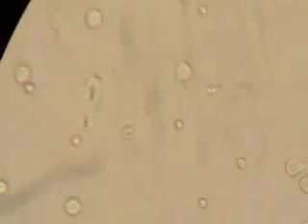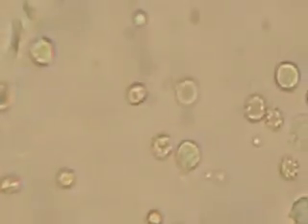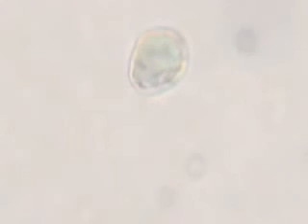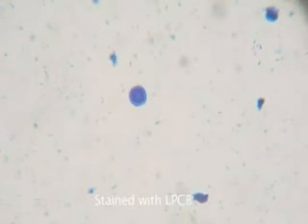You will also see them tumbling and rolling over. Sometimes it just stops moving for a moment and makes the smear lifeless. This squirting movement is typical whenever you could see it. Cysts seen here are relatively immobile, round with double-layered wall.